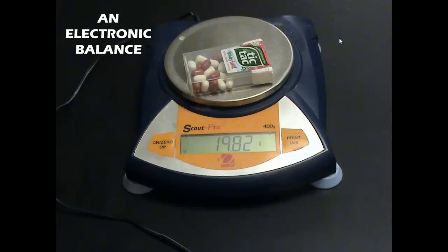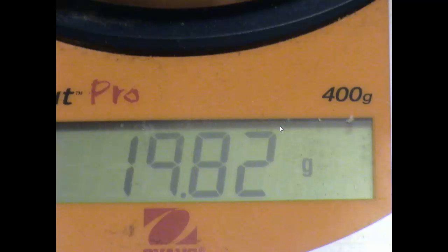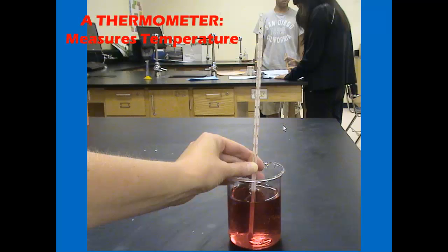When we measure mass in a chemistry lab, we use an electronic balance. You might be saying, this is great. I put the tic-tac container on the balance and immediately I found a value of 19.82 grams. It seems like I don't have to do any work in terms of measurement. But you should be aware that the 2 that's at the very end of this measurement is actually estimated by the electronic balance. The 1, the 9, and the 8 were known with certainty. The balance knew that it was 19.8 grams. However, the last digit was estimated to give us a final value of 19.82 grams.